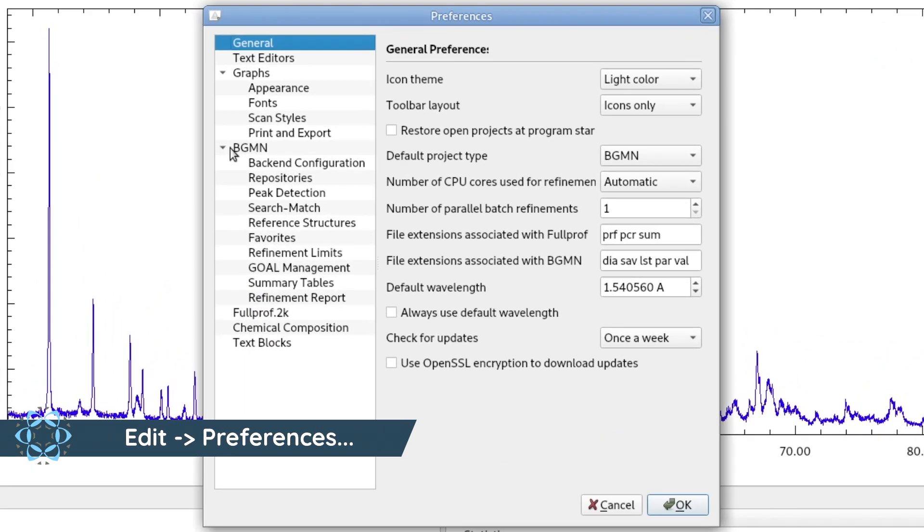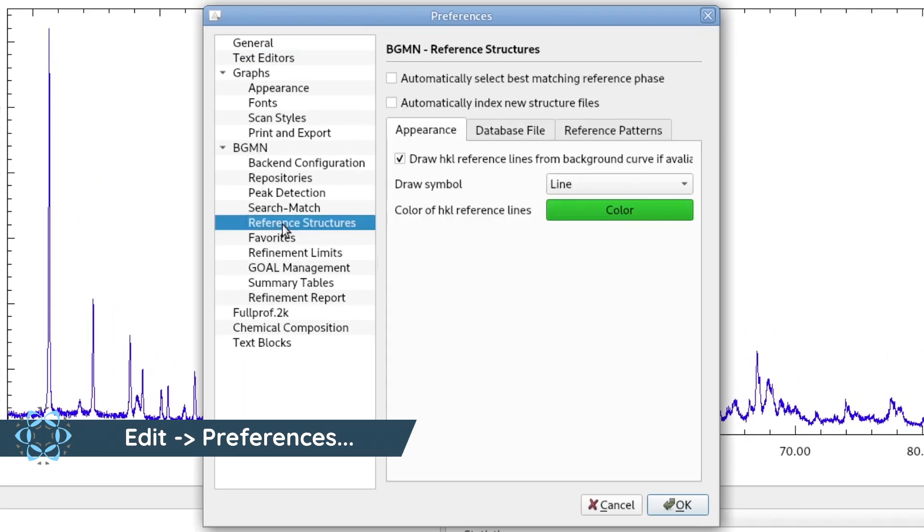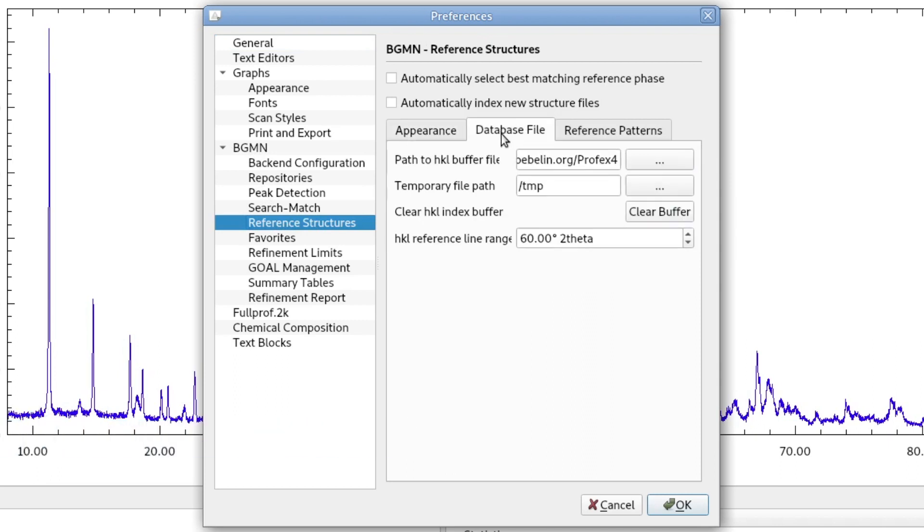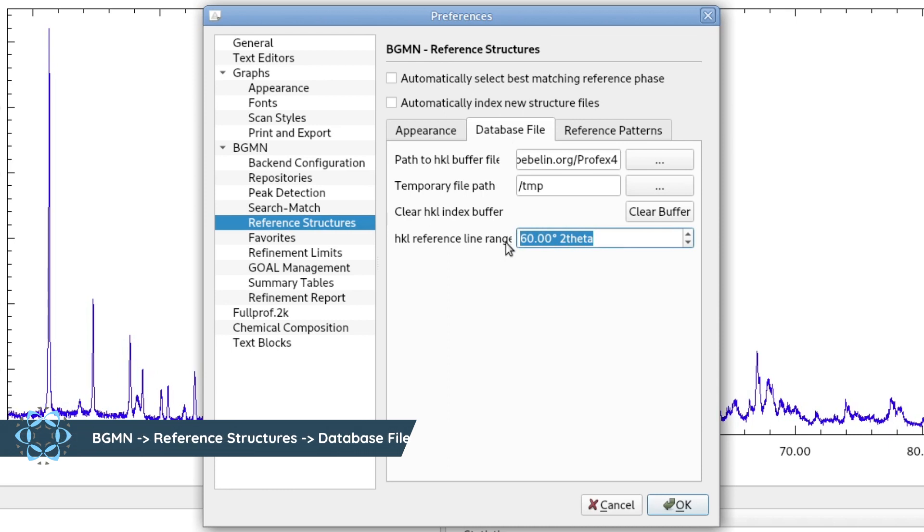In the section BGMN, on the page Reference Structures, we go to the tab Database File. And here we can set the upper limit.